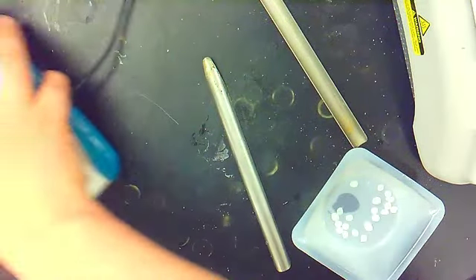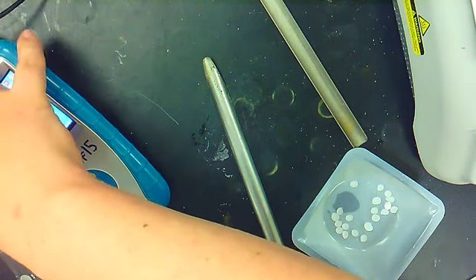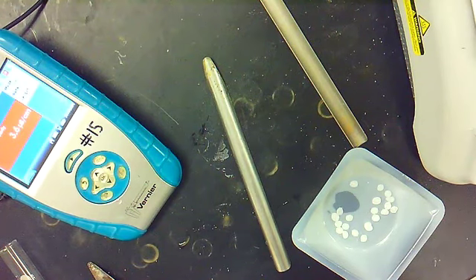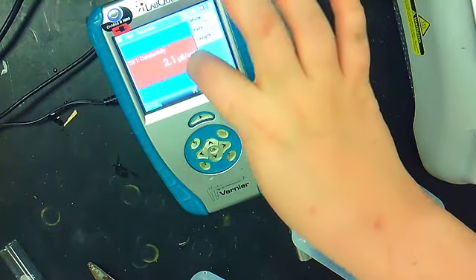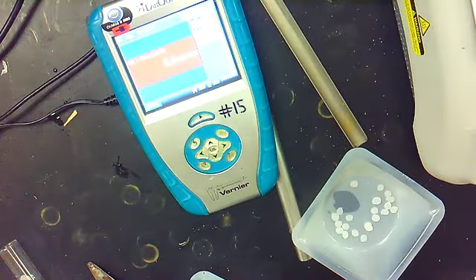Now we're going to test the conductivity. Hopefully this works a little bit better than it did yesterday, because we are using different probes this time, and so that should help with the lack of contamination. So let me zero it out. Okay.